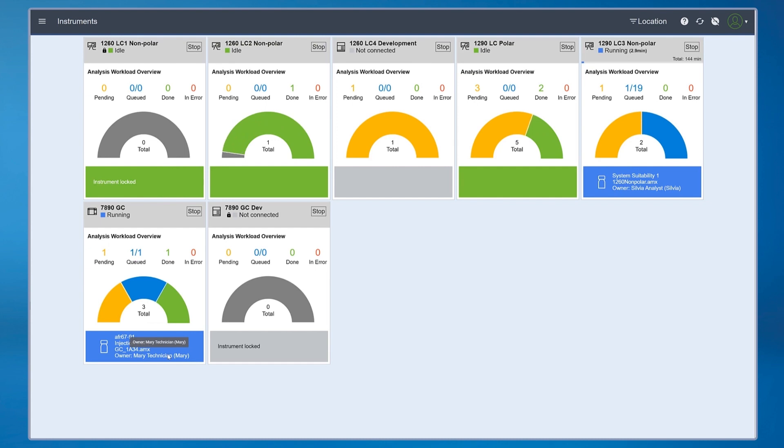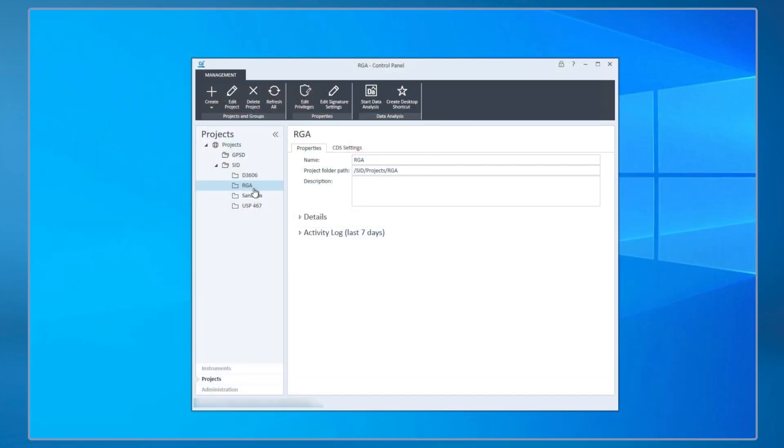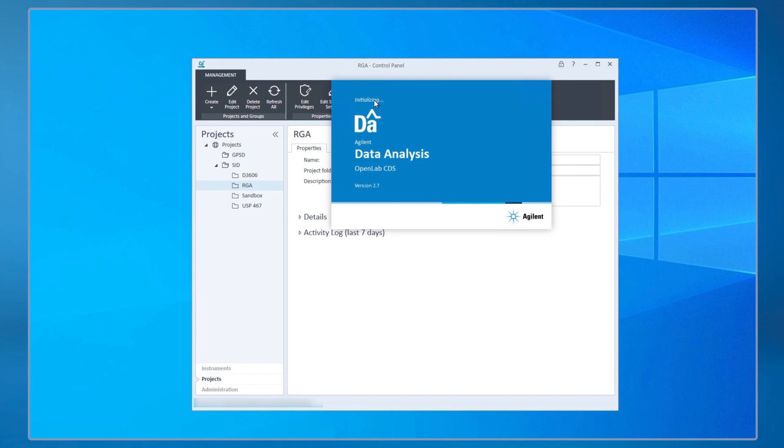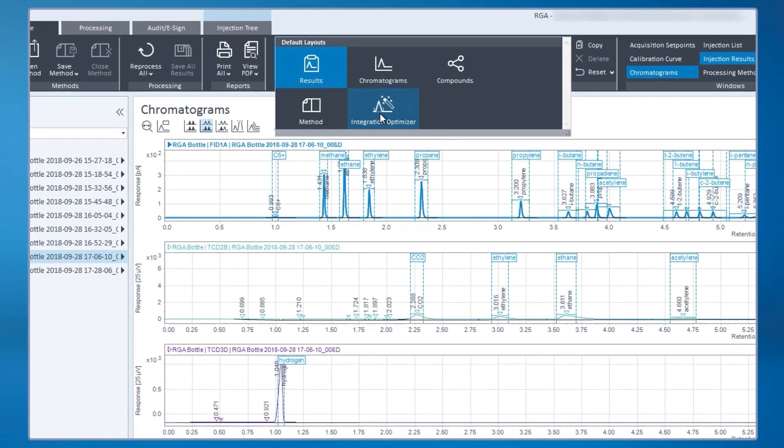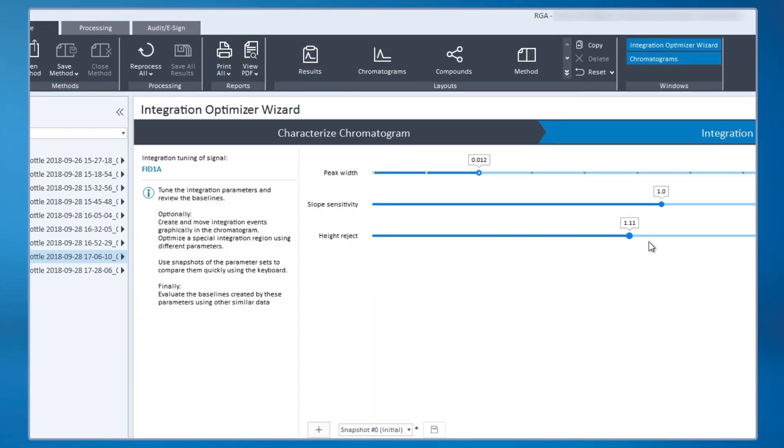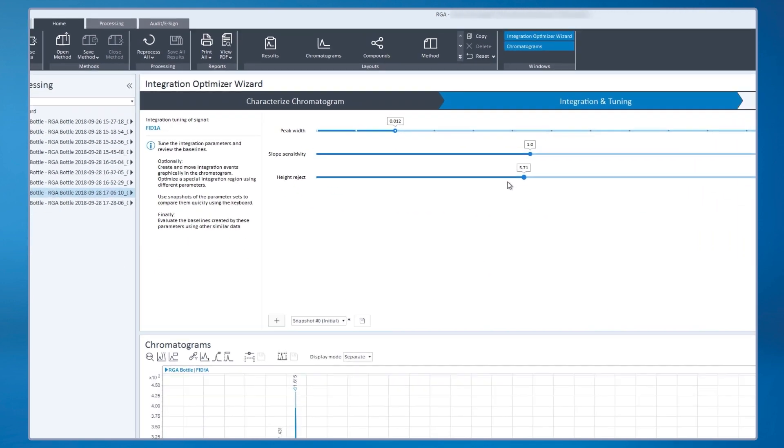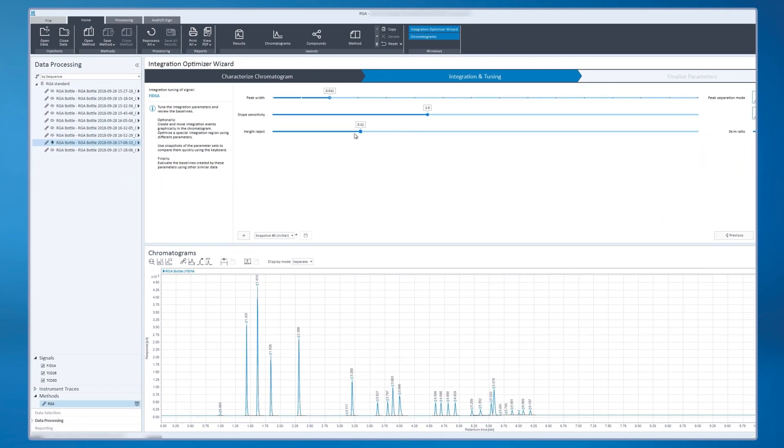Later, once OpenLab CDS has collected the results, you'll log into the project in Data Analysis, which has easy-to-use tools like Integration Optimizer that will improve the accuracy of your results by allowing you to optimize your integration parameters and see your changes in real time.